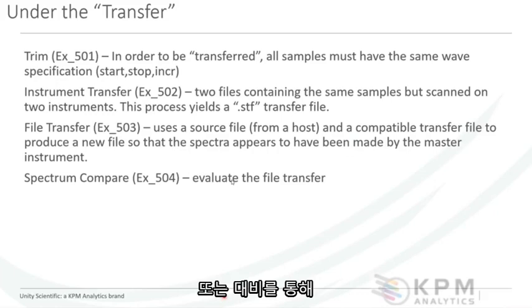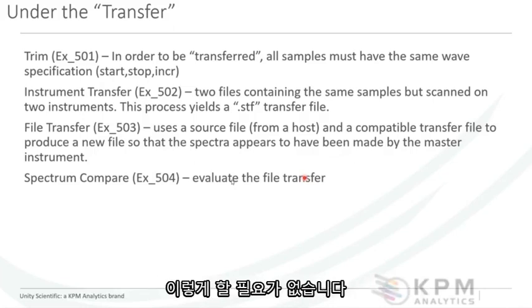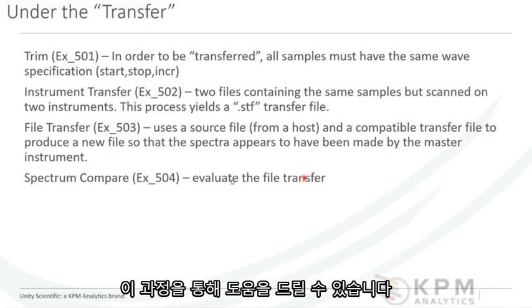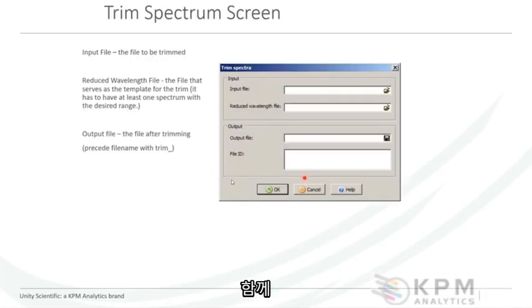And the last one is a spectrum compare or contrast, and you can evaluate your file transfer and how well it's done. So we're going to go through this really quickly. Again, most of you won't have to do this, but the exercises take you through step by step, and we'd be happy to help you through this.